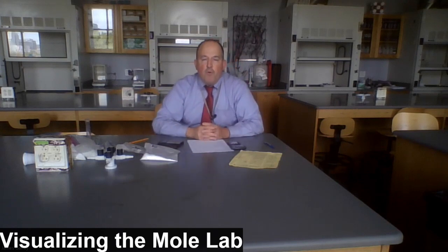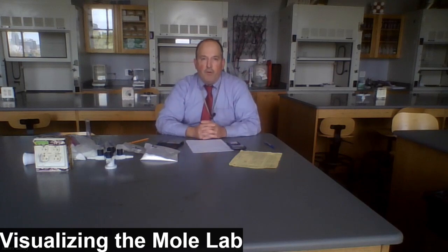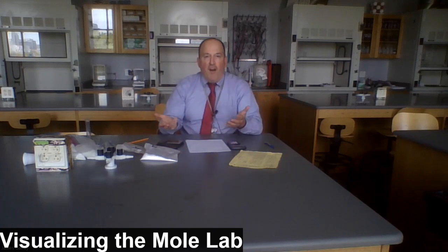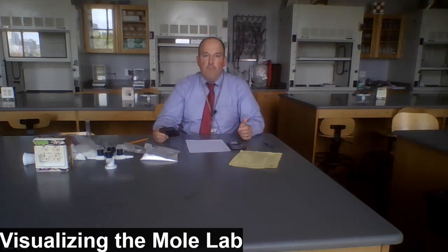Our hope is that with this lab, you've gotten a little bit of a sense of the tangible size of a 1 mole sample. And if atoms are so very, very small, we need to be working with enormous numbers of them in order to provide sizes that our limited instruments like this electronic scale can actually register and work with in lab.